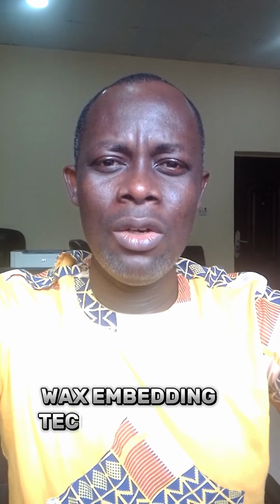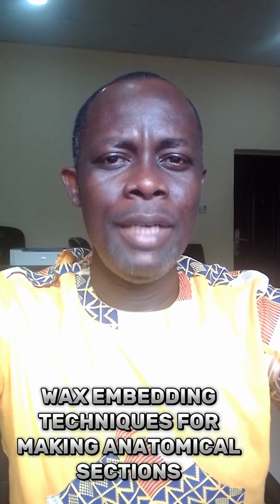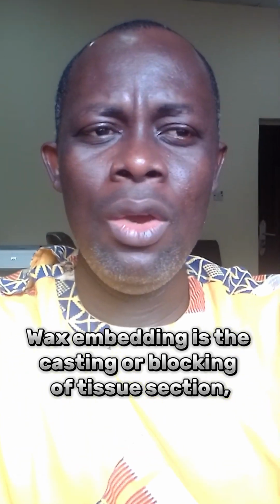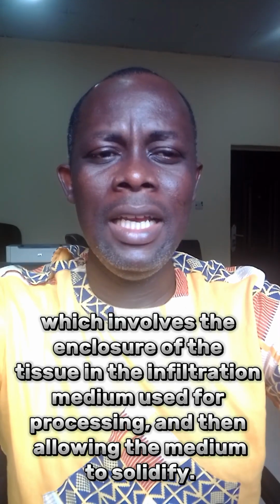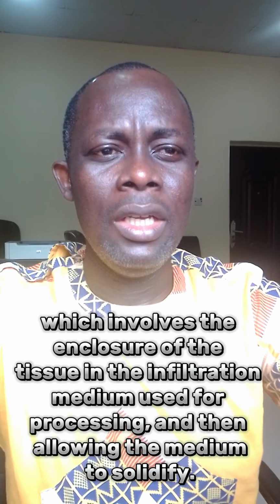Today's lecture is on the wax embedding techniques for making anatomical sections. Now, what is wax embedding? Wax embedding basically refers to the casting or blocking of tissue sections, which involves the enclosure of the tissue in the infiltration medium used for processing and then allowing the medium to solidify. So it involves enclosing that tissue in an infiltration medium such as wax and allowing the medium to solidify, and that enables the histologist to easily section the tissue into smaller parts.